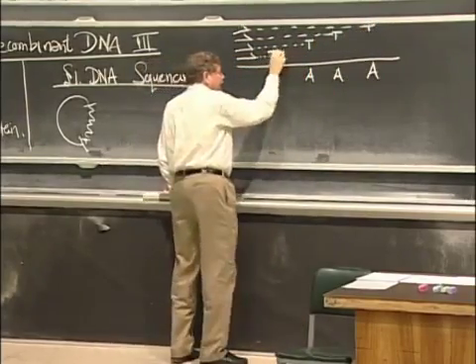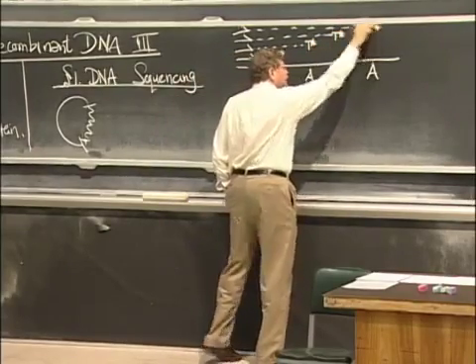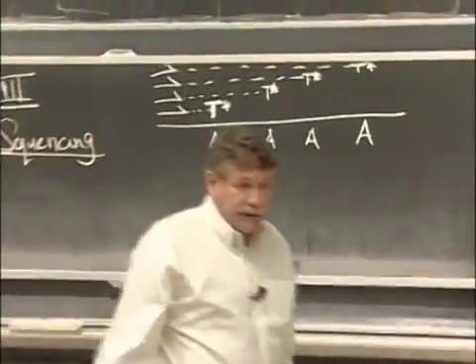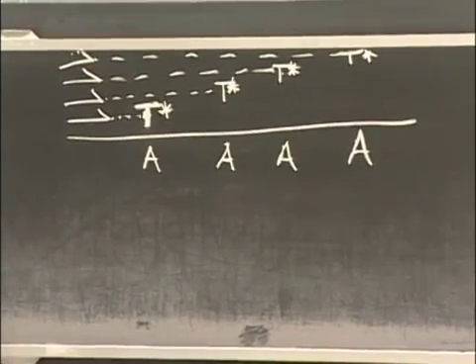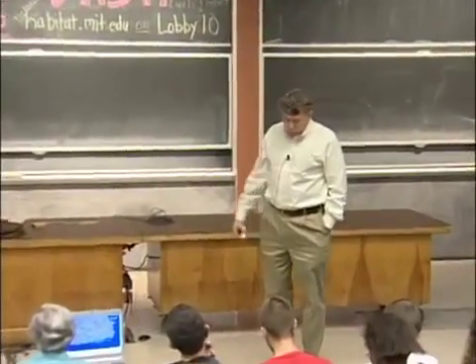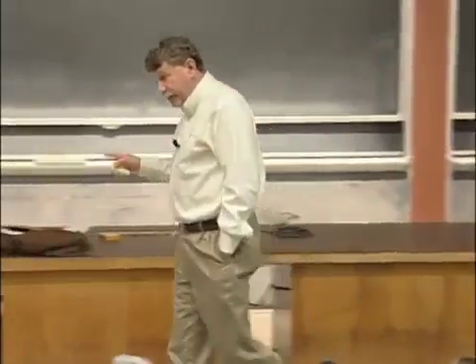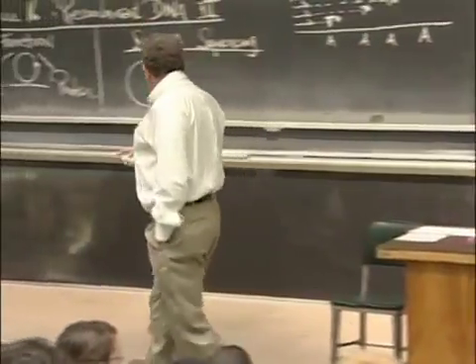And we had this clever trick, for which Fred Sanger actually won a Nobel Prize, of using a defective version of the nucleotide T that would stop at that point. But remember, we didn't use only defective T. We used a mixture of good T and defective T. Let's say defective T was 1% of the whole mixture. Whenever we encountered a defective T and put it in, the chain would stop because it couldn't be extended. Whenever we put in a good T, it would keep going.